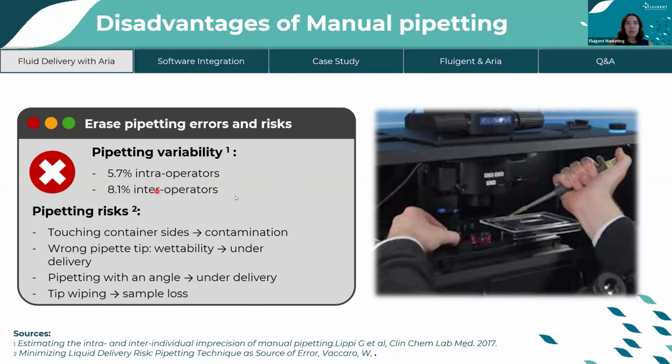When it comes to integration with microscopy, manual pipetting has to be done on the stage, which also comes with the danger of moving the microscope slide, especially shifting the field of view if you're acquiring stacks or running multiplexed experiments.